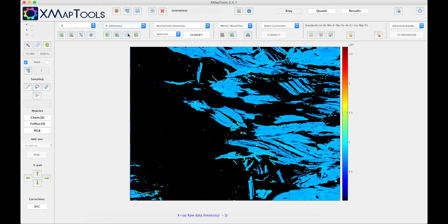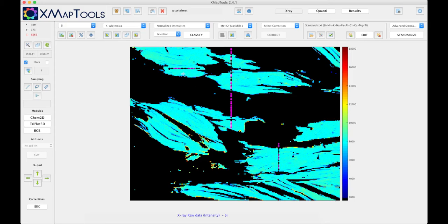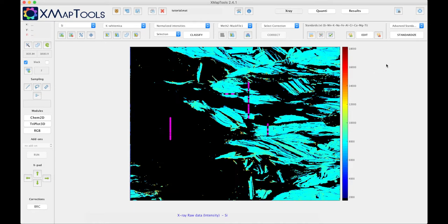For that we need a phase, in this example white mica, and we need to have some spot analysis that we use as internal standard. In this example I already unselected some of the spot analysis, those that were located near the grain boundary or near mineral inclusions.